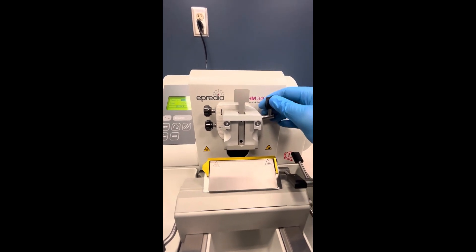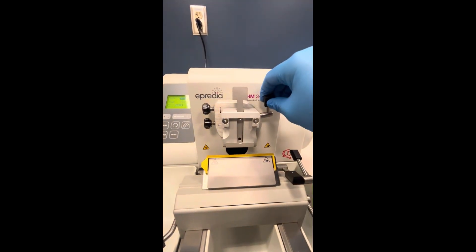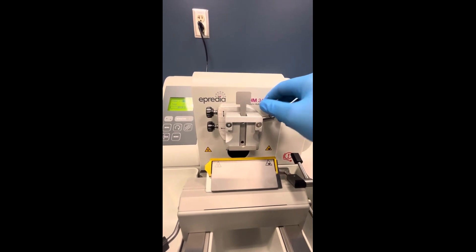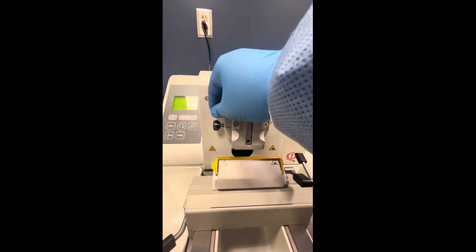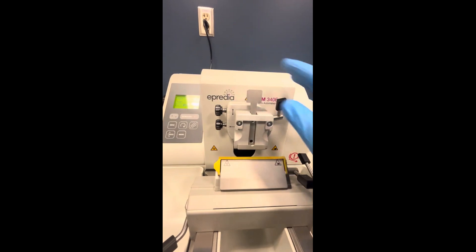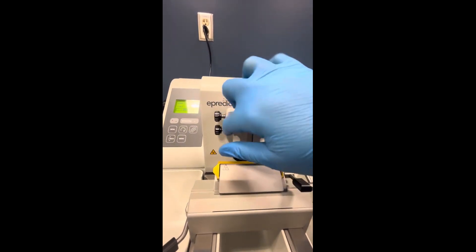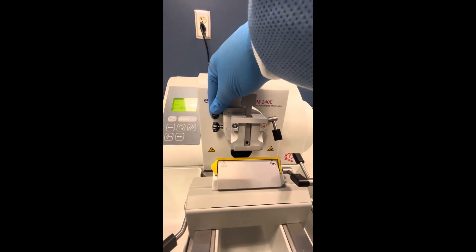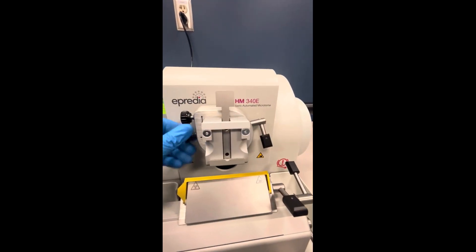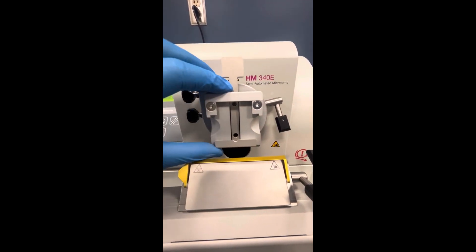This lever allows you to use the orientating screws. There are two orientating screws and an orientating lever. When this lever is in an upwards position, any manipulation of these orientating screws won't do anything. When you turn this lever down, that allows you to have movement of this device with these orientating screws. You can see it rocking a little bit — it goes from side to side and up and down. The motion is very subtle.